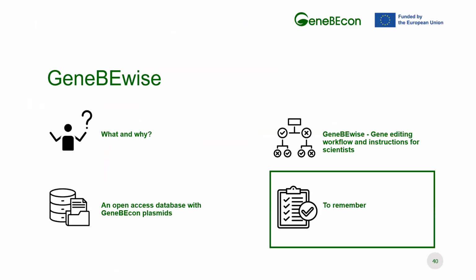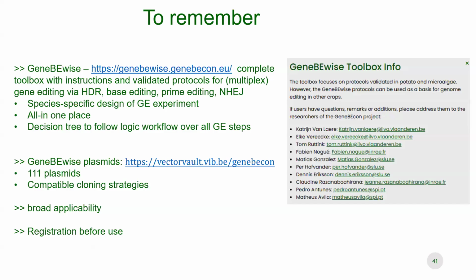So by this, I come to the end of the presentation of the GeneBeWise toolbox. What is important for you to remember is the website, of course, where you can find the GeneBeWise. If you go to the GeneBEcon website and then click on the GeneBeWise icon, then you will find the complete toolbox with instructions and validated protocols for multiplex gene editing.